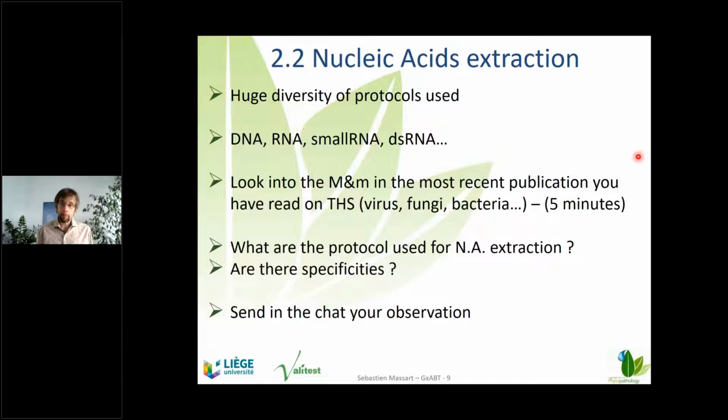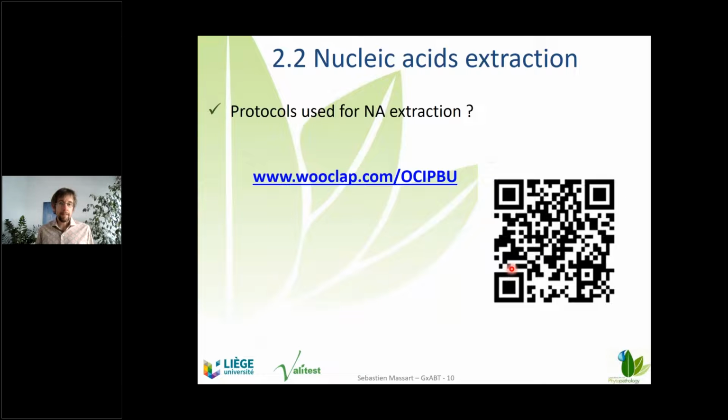And so for them, it's advised to have an extraction which allows long nucleic acid, long DNA fragments, in order to harvest the advantage of the technology. But globally, what you can have in mind is that it's similar to what has been used.